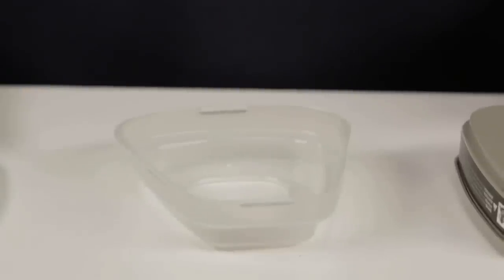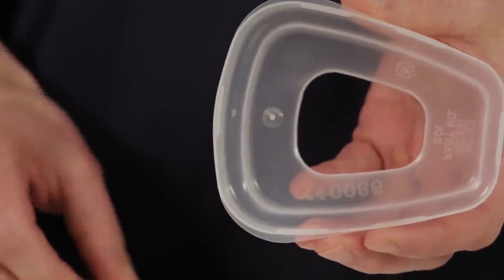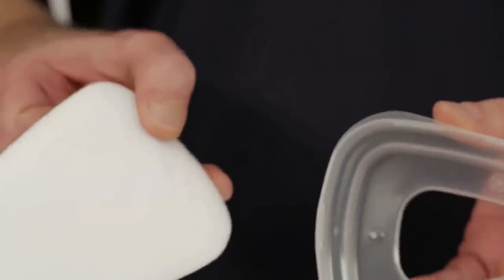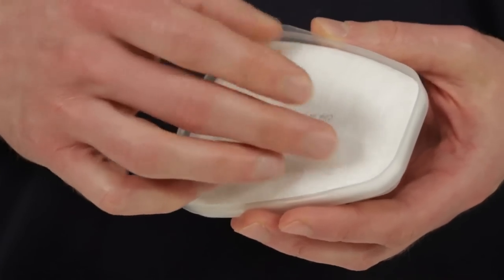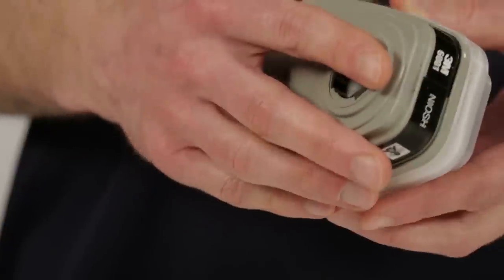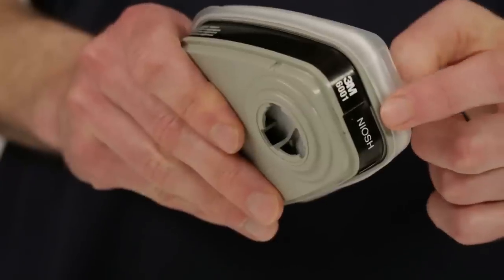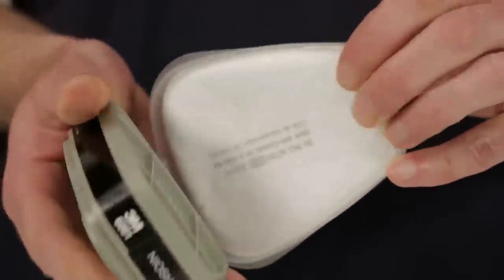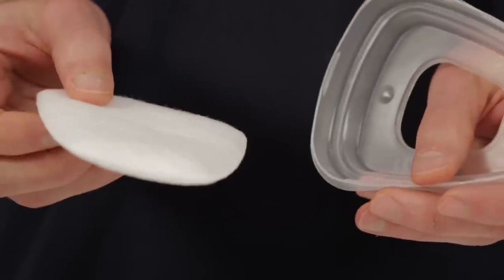If your work environment requires both a chemical cartridge and a particulate filter, you may attach particulate filters to the chemical cartridges. To attach the 3M particulate filters 5N11 or 5P71, place the filter into the retainer with the printed side facing away from the retainer. Press the filter retainer firmly onto the cartridge until it locks securely. Correctly installed, the filter will completely cover the face of the cartridge with the printed side facing the cartridge. To replace the filter, remove the retainer by lifting on the tab.